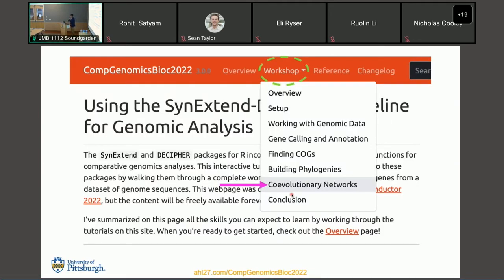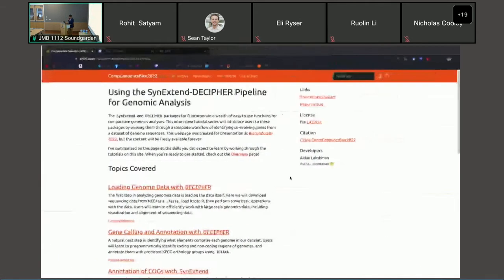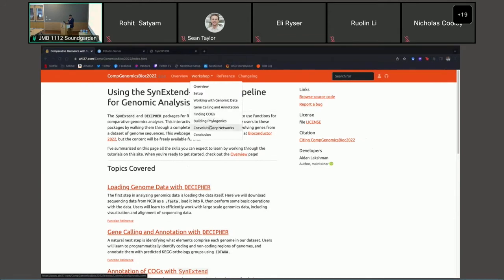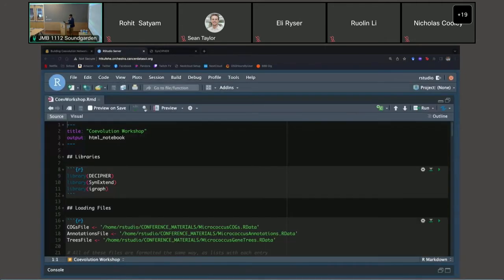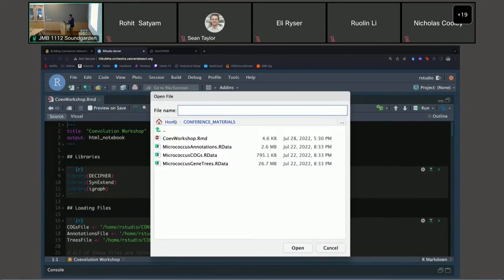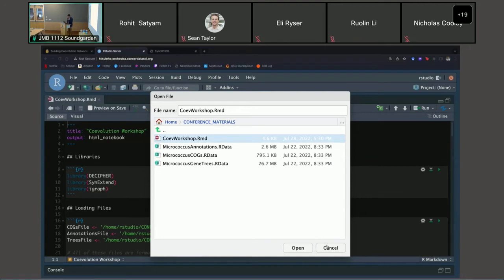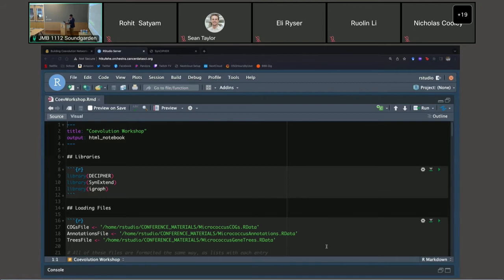Now we can finally get to the code. If you're on the website, go to Workshop and then to the 'Co-Evolutionary Networks' tab — that brings you to the vignette. If you're using the Orchestra container, launch it and open the file under conference materials called 'CoevWorkshop.Rmd.' If people have any problems accessing any of this, let me know.